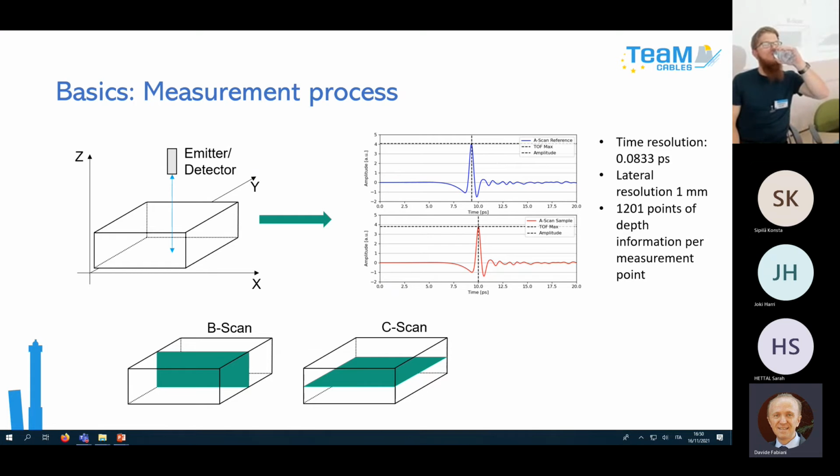So we can also visualize that. But in this case, we are assuming that the thickness would be the same for every xy position, and that's not the case, in fact. So it's a local measurement at one point and not an average value over all the sample surface. Okay. Yeah.